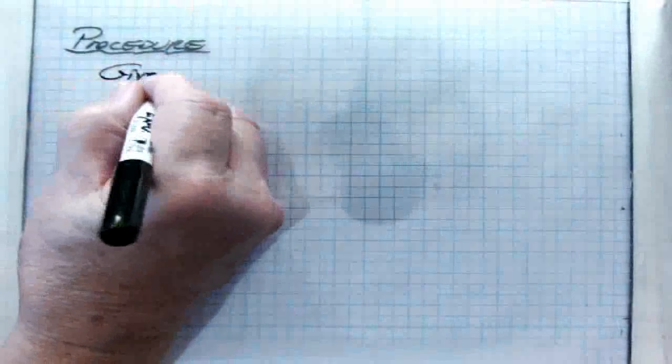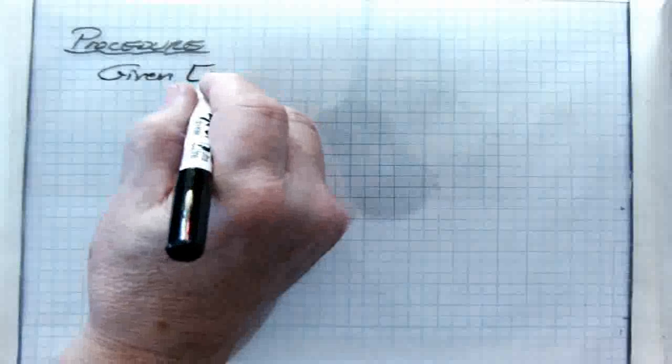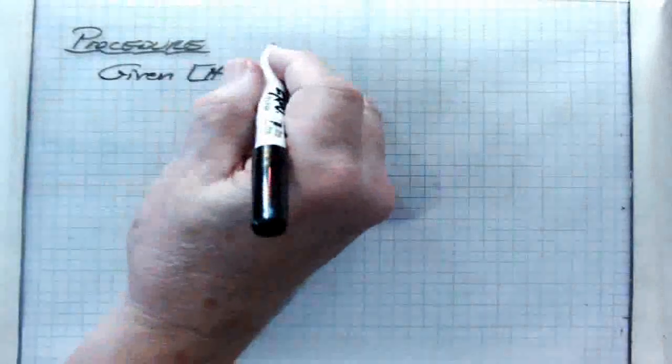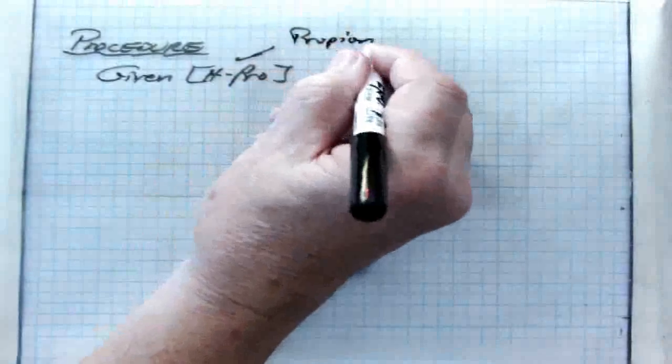Generate entire titration curve and determine equivalence point.